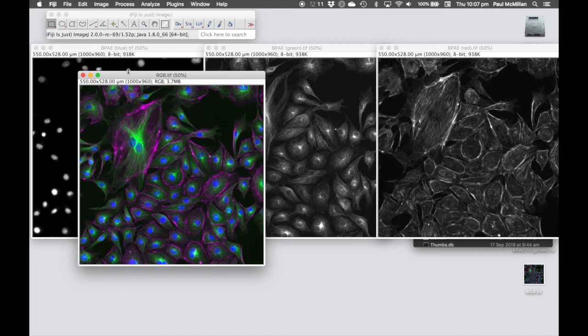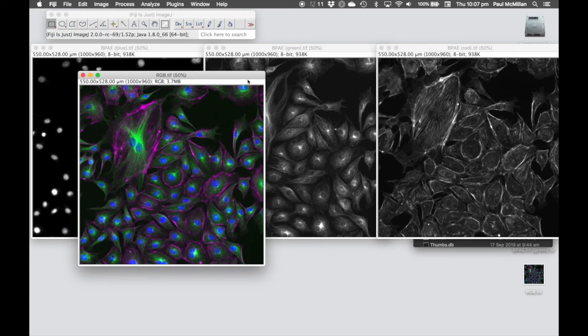So, nice and easy. That's how to take three individual channels and merge them into the same single image. Note that the channels need to be the same physical size for that merge to happen.